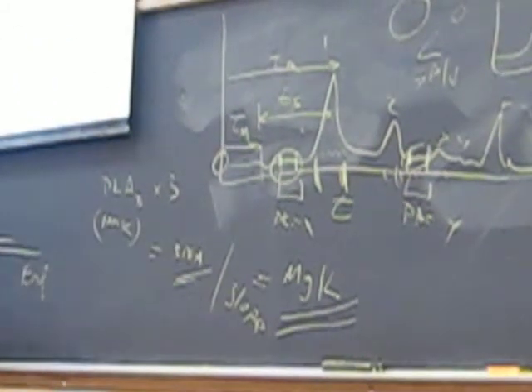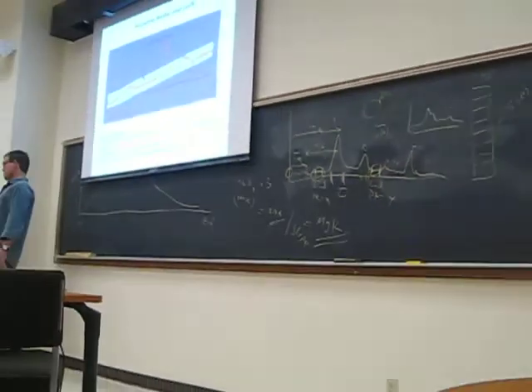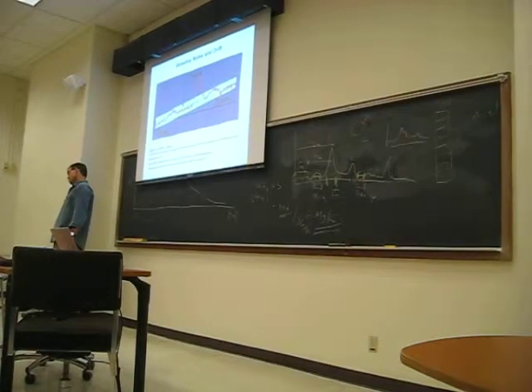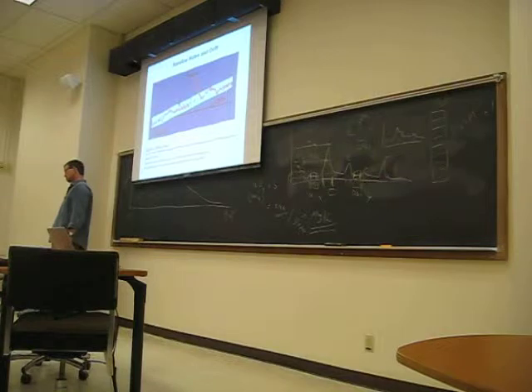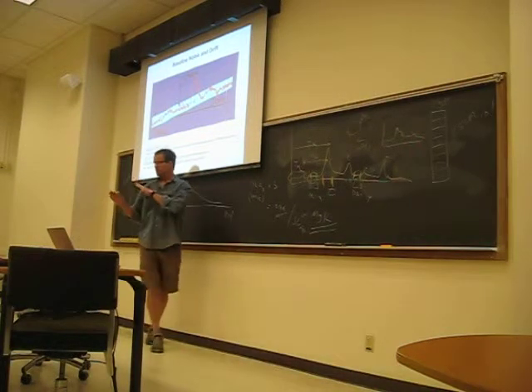So this LOD for the chromatogram is the signal-to-noise ratio, or are we going to have a separate one, like our limit of detection on the standard curve? Are they going to be related? They're going to be the same. Well, because in the last lab report we did 3 times the standard deviation plus the blank. So will we be using that method for our standard curve? Okay, so I'll answer that.